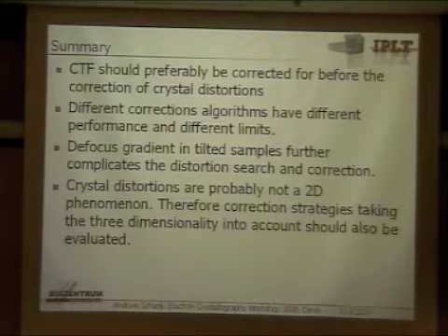Different distortion algorithms have different performance and different limits. So we saw, for example, if you just shift back the unit cells, that's one limit. This probably works well as long as the crystal doesn't have any rotated unit cells. As soon as it does, it breaks down.